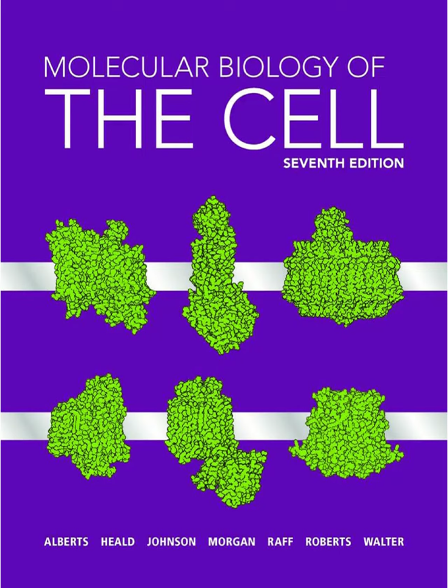Okay, so contrast in TEM comes from differences in how much electrons are scattered. Biological stuff is mostly light atoms. How do you get enough contrast? You mentioned osmium. Right, osmium tetroxide fixes and stains lipids and proteins. But usually sections are also stained with solutions of other heavy metal salts like uranium, uranyl acetate, and lead citrate.